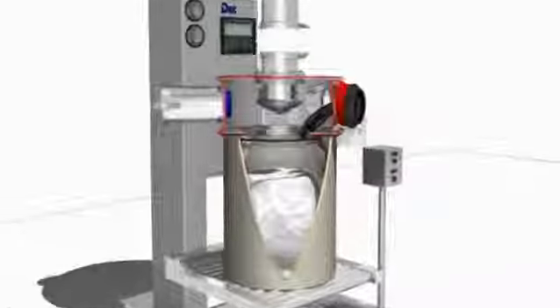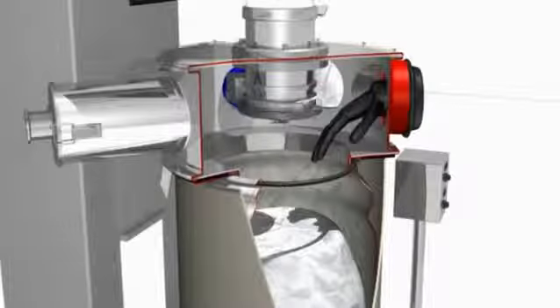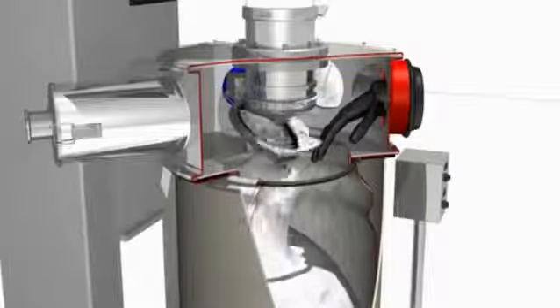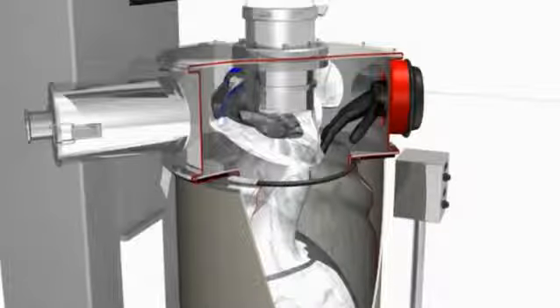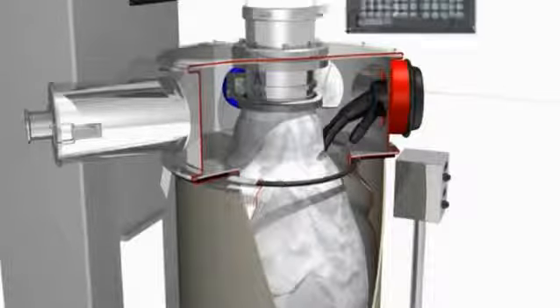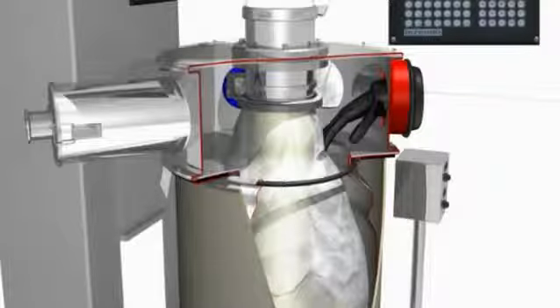The drum is sealed onto the isolator ensuring an airtight seal. The isolator contains all the safety HEPA filters and connections required for safe operation.